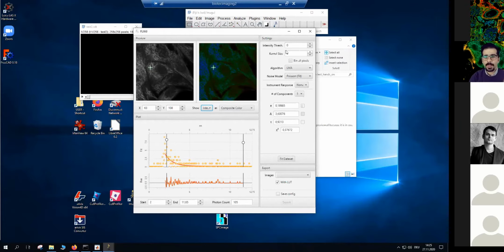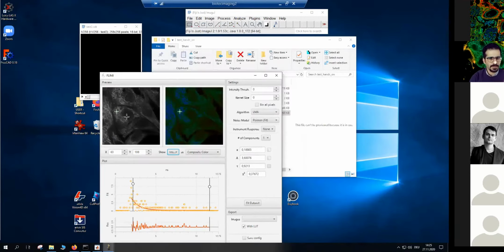This is for sure. Okay, the first one is intensity thresholds. Again, I would like to find out where the background is. When I hover the mouse over the pixels, I don't see any information here, but I can see it on the plugin itself. So just hovering here, something about 20, 25 would be right. So I just apply 20 as a threshold. Exactly, that's how I did it for SLIM Curve.